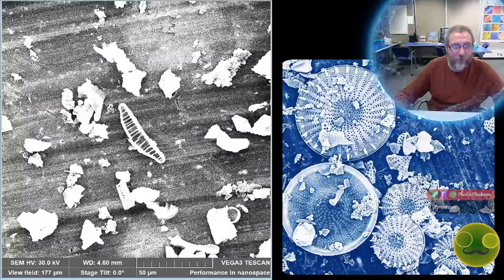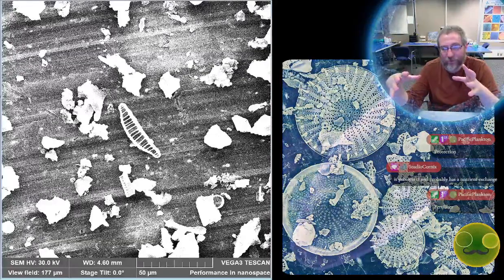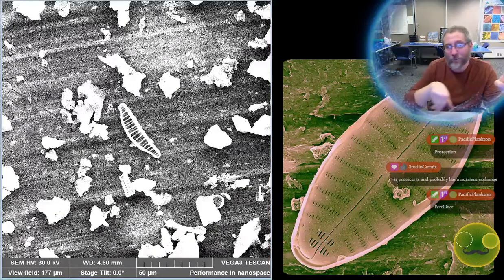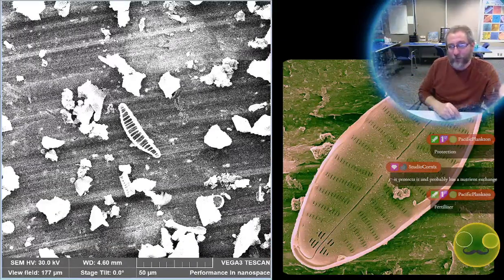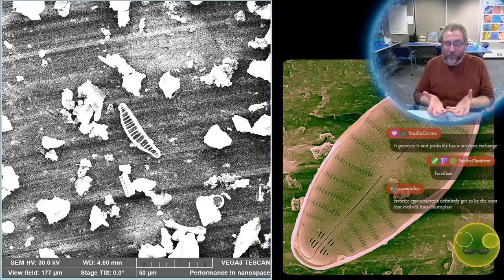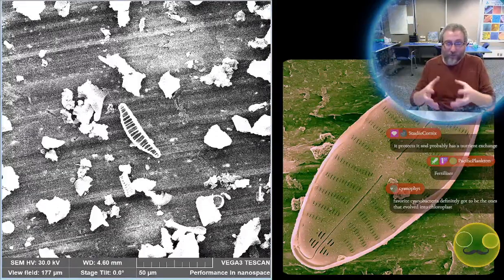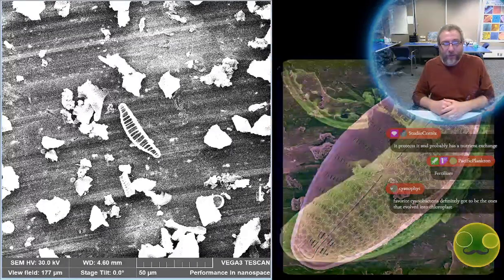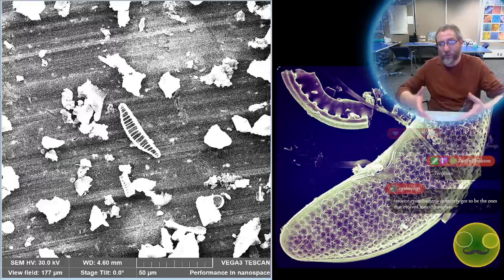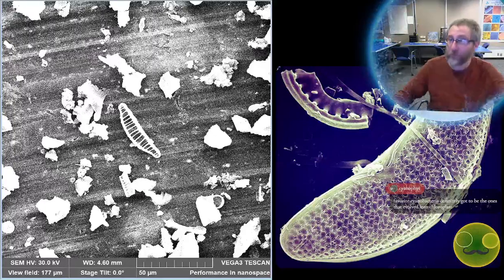One of the things that helps is that in order to get from nitrogen to nitrate, it has to pass through ammonia. And ammonium is a reducing environment. And for a lot of the cyanobacteria, the way that they manage that is they put this mucilaginous sheath over the outside of their body, which makes them a reducing environment naturally, because the oxygen can't get through it very well. And I think one of the reasons why they want that home is basically they don't have to exert energy to make an oxygen deficient environment that allows them to fixate nitrogen pretty easily.